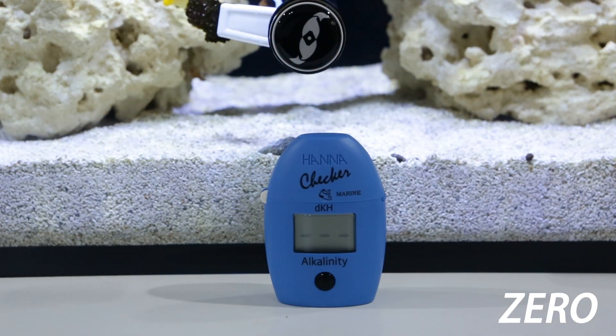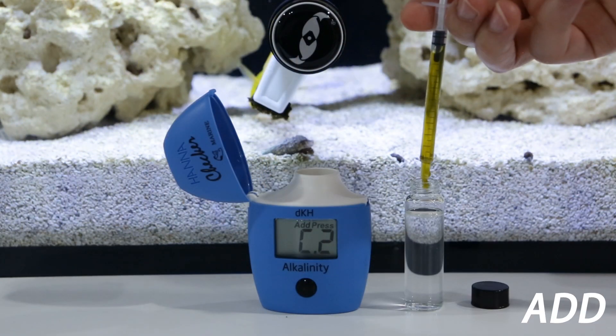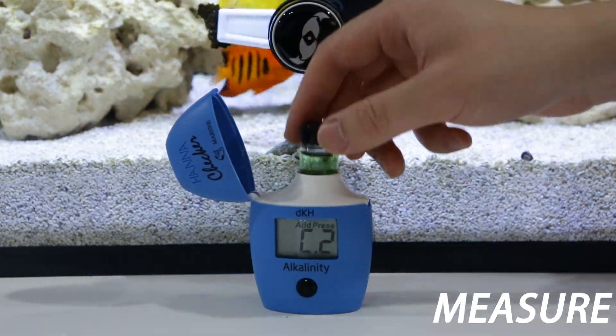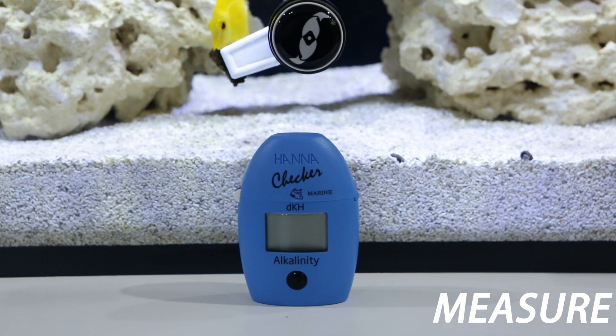First, zero the checker with your water sample. Done. Second, add the reagent to the vial. Easy. Then just insert the tube and get your reading. Wow.